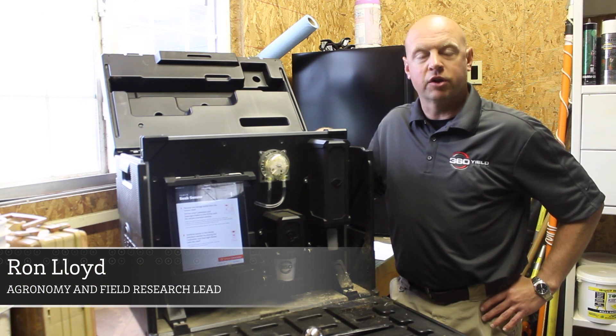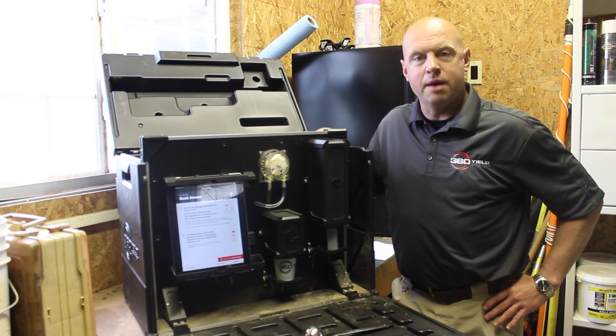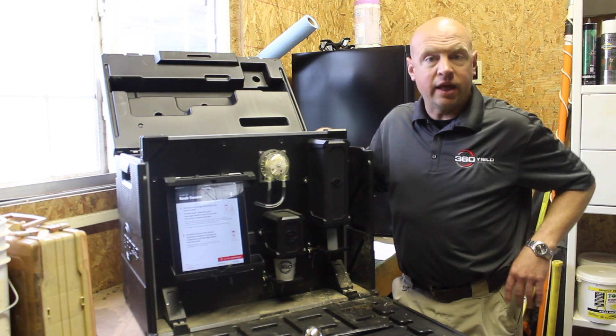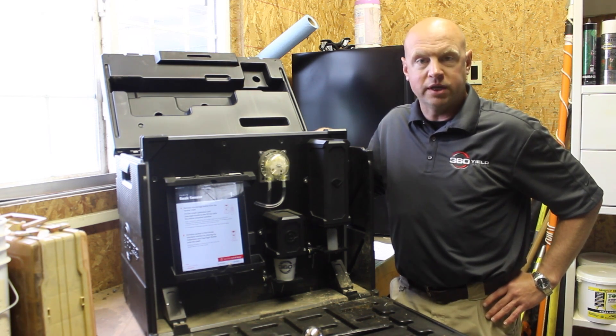Hi, I'm Ron Lloyd, the Director of Agronomy here at 360 Yield Center. Today I want to spend a little time and talk about the 360 Soil Scan and some best practices to make sure that we get the best quality sample that we possibly can.